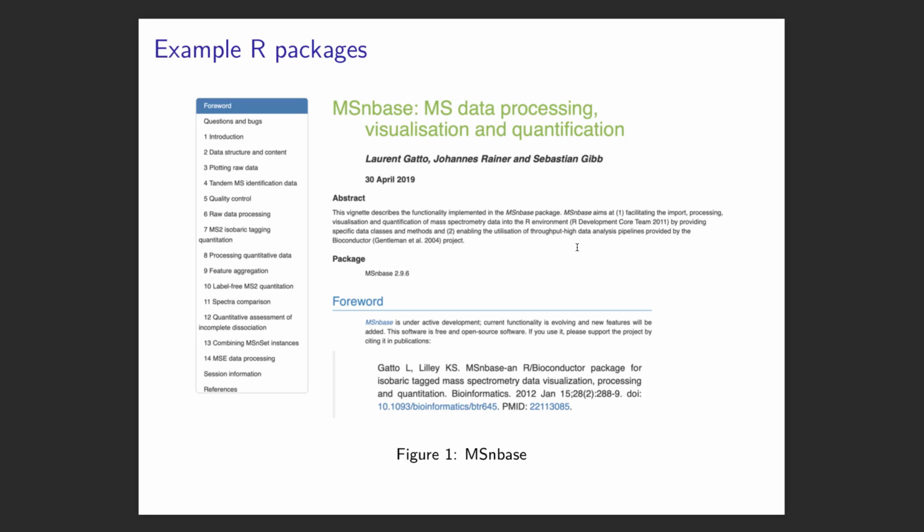It's not used as much anymore in favor of the newer SummarizedExperiment class, but MSnbase was originally inspired by writing essentially a proteomics version, a mass spectrometry specific version, of the classes found in some of those original Bioconductor packages.